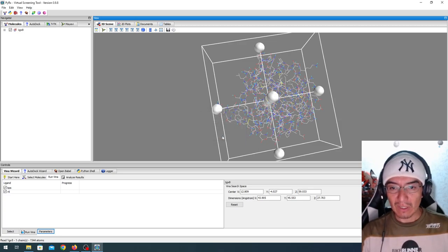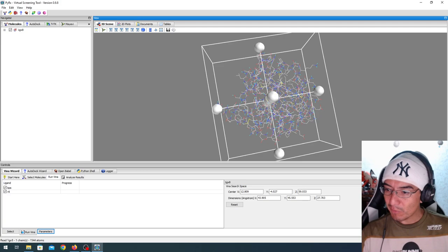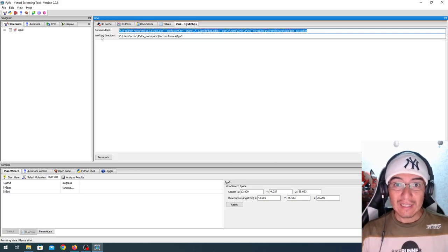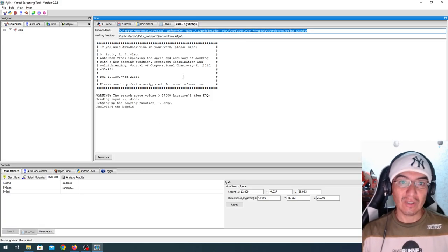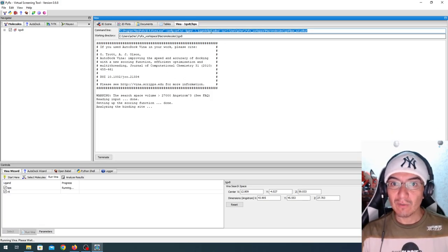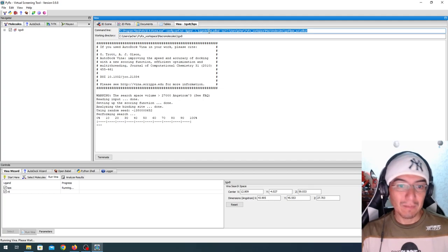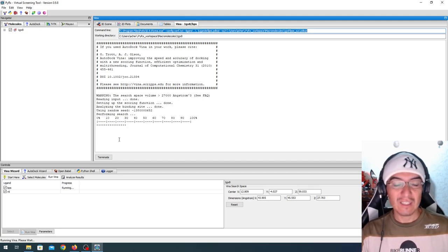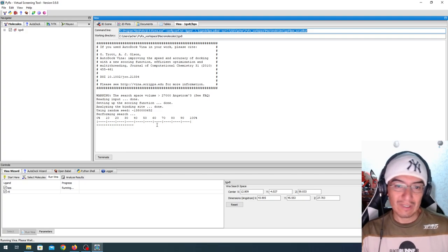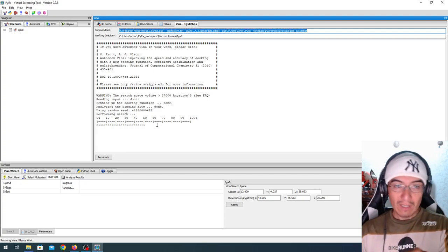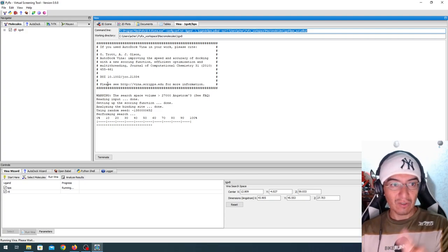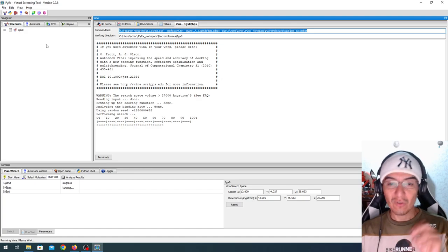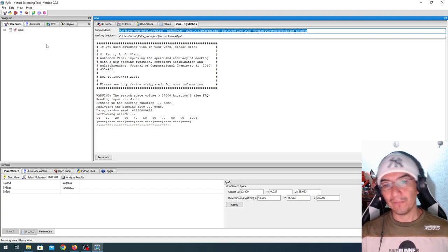I click OK, and then I'm going to go forward. And here is where the docking begins. We can see from the command line that it's BPS, the first one. Because my exhaustiveness is low, it's running very fast. And once this docking is done, it's going to move on to the retinol.